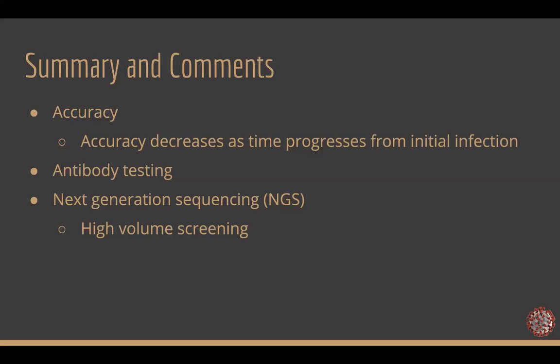Again, NGS is a much more complicated process, and it will allow a lab to essentially test thousands of people all within one reaction versus the current test, which is the PCR test, which will only allow us to probably maximum test maybe like 300 people. So going into this step of NGS will actually increase the volume of people that we are testing.